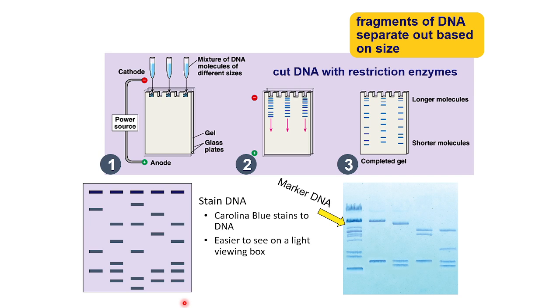So there are 2 ways of how you can stain the DNA. The easier way is to put it under a UV transilluminator and click a picture of it. You can see it very well, because when you are running the gel or preparing this agarose gel, you use some kind of ethidium bromide. You use a small amount of ethidium bromide. Ethidium bromide intercalates among the major groove of the DNA, and it allows the DNA to glow under the UV transilluminator. So it's like a fluorescence.